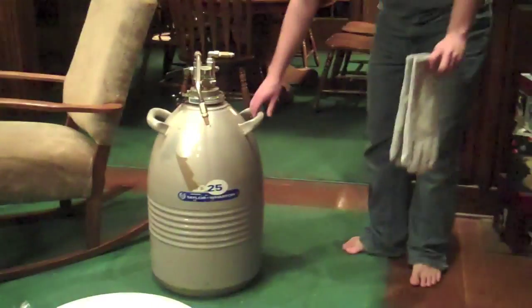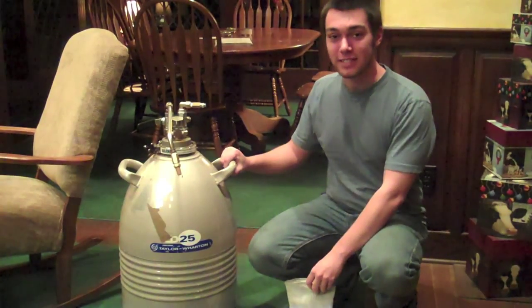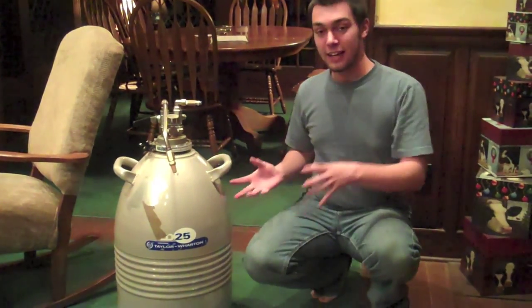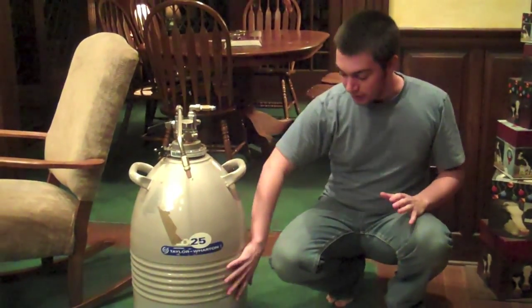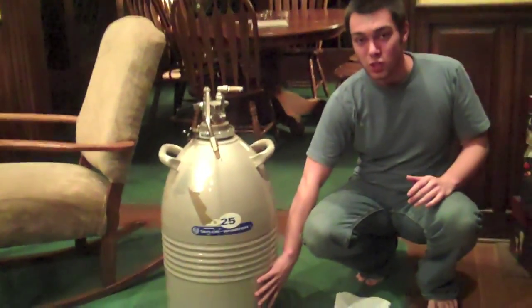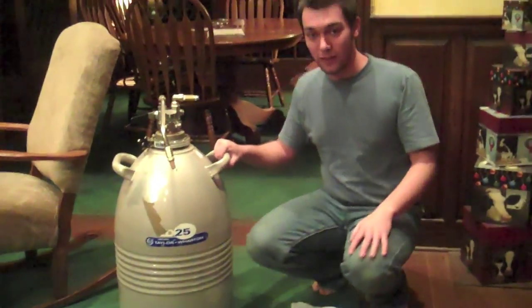I'm going to show you all the basics of liquid nitrogen. This right here is a 25 liter liquid nitrogen Dewar. It's basically a super, super insulated thermos. There's an outside jug and an inside jug and there's a vacuum in between them so there's very, very little heat transfer. It feels room temperature outside but inside it's negative 320 degrees and it can keep it for up to 109 days. It's that well insulated.